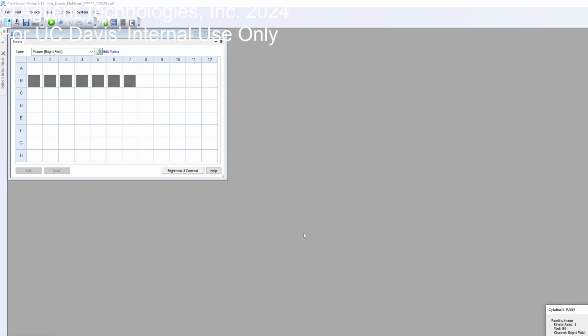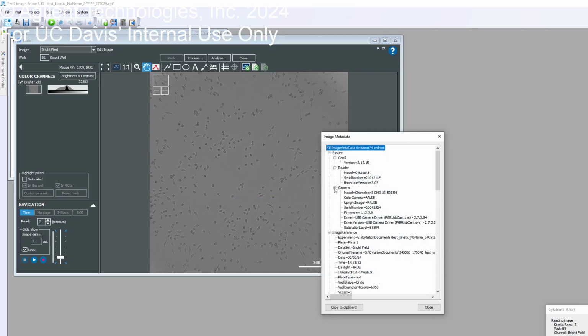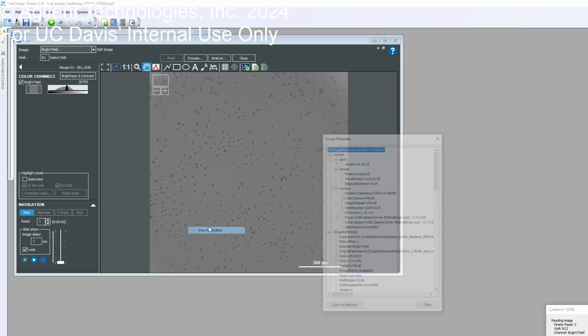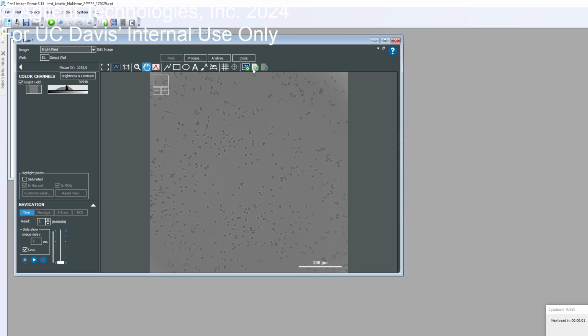If you go to different time points, it will also give you timestamps. It would show me down here. Yeah, so now it's going to go to the second read. Right now it says variable, but once you export it, it will have the timestamps. And you can also click on this image and view metadata, and this will tell you the system date and time. So this is 5132, right? And if I go back to this one, 06. Okay, it's actually a little less than that.